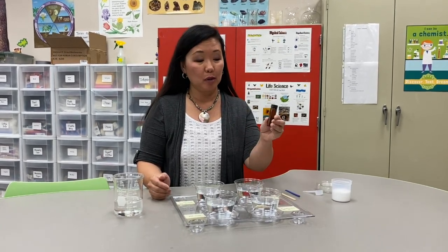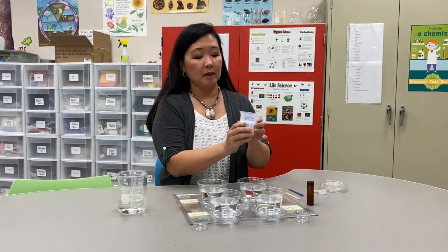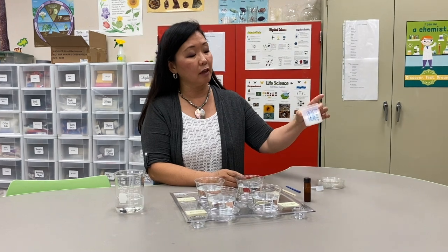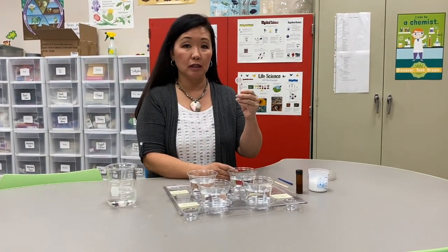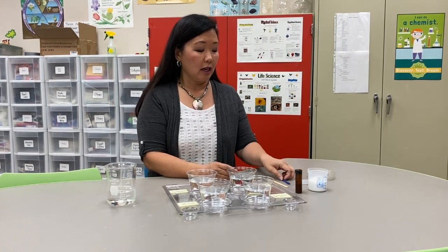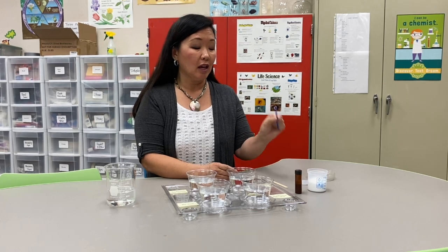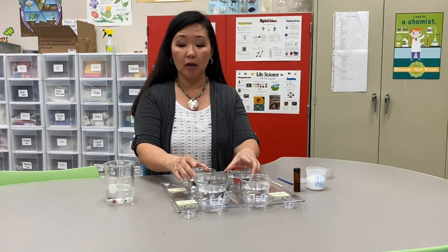I have a little vial of brine shrimp eggs, a cup of kosher salt, a measuring spoon — a teaspoon for the salt — a measuring spoon for the brine shrimp eggs, and a stir stick.